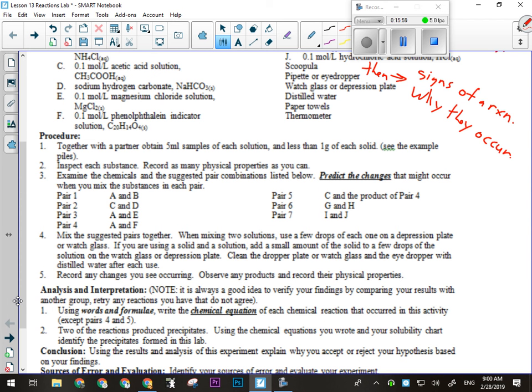That should take care of what we need to do for the lab part. When you first get over there, get your safety goggles on. It might not be a bad idea to put on a lab apron. They're hanging on the wall just when you come in on the right-hand side, because like I said, this stuff is all quite concentrated. Any questions before we go across?